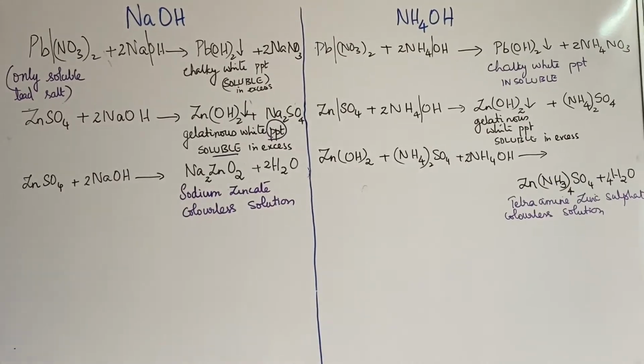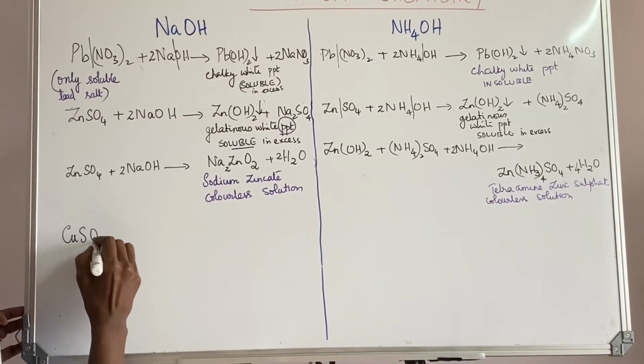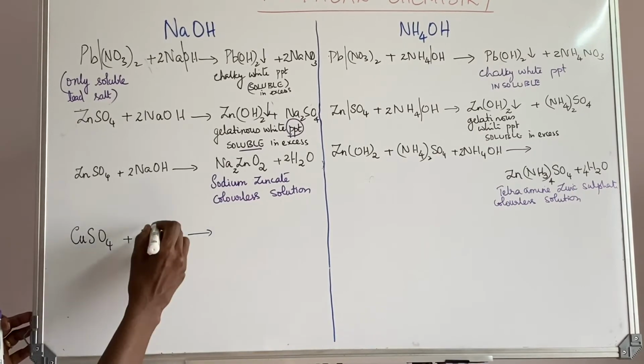Okay, when you come to copper sulphate again, there is something different. With sodium hydroxide, again a double decomposition reaction.